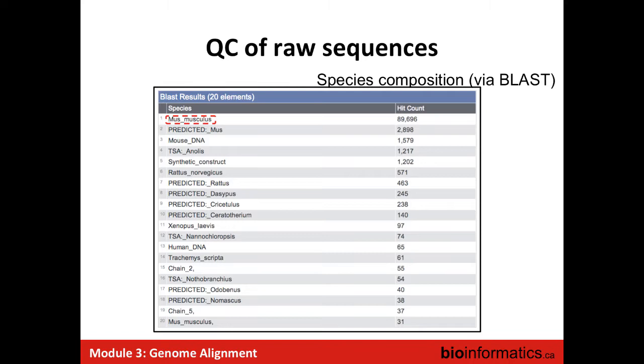if I see less than 1% or 0.1%, I would be fine. Because I know that, just by the reference assembly, I would lose around, depending on the species, 1 to 10% of my reads just because the assembly is not good enough to align all my reads. So if I have 0.1 or 1% of something that has been contaminated, if it's too close to my species, I would probably be worried.